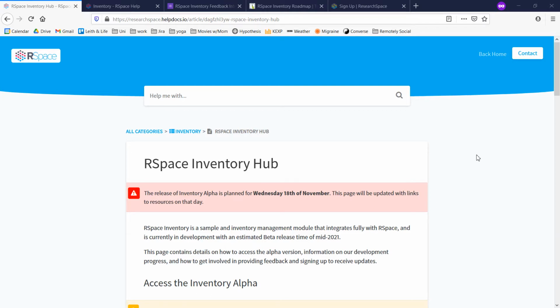The purpose of this video is to give you a quick overview of the features in this initial release of Inventory Alpha, and we will be making new videos for each new release of Inventory Alpha.